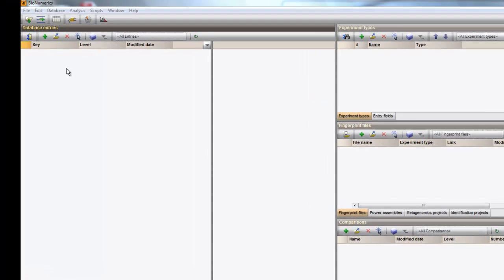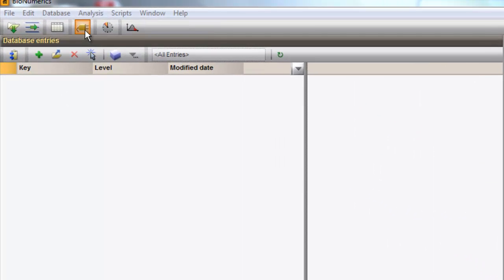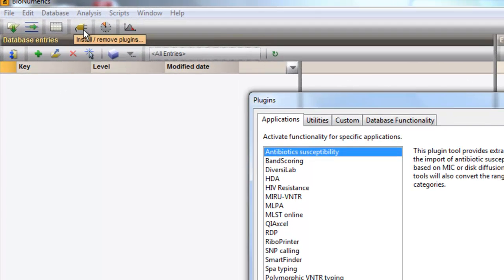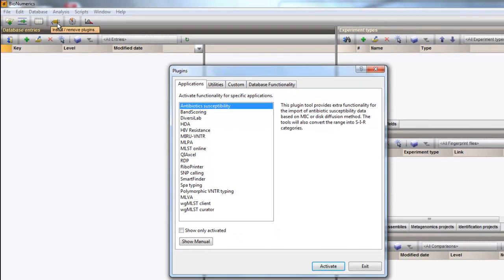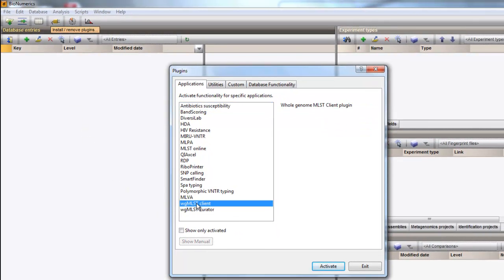To install the plugin, click the Install-Remove Plugins button and highlight the Whole Genome MLST client plugin. Next, click Activate.